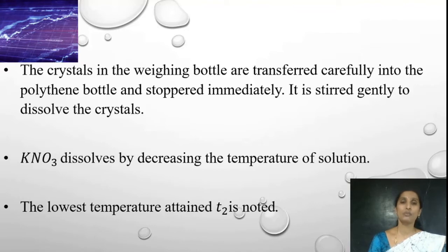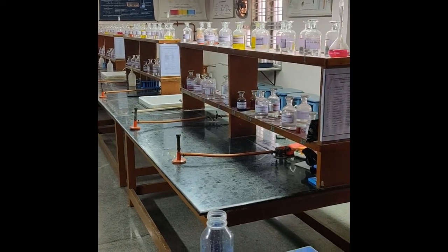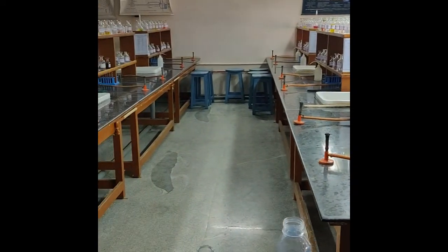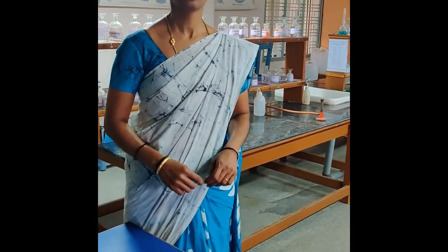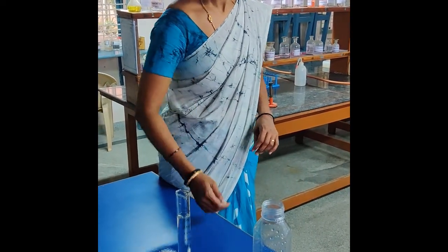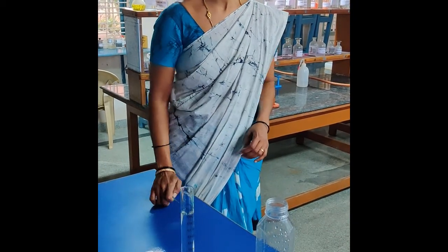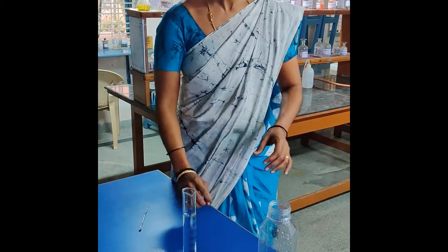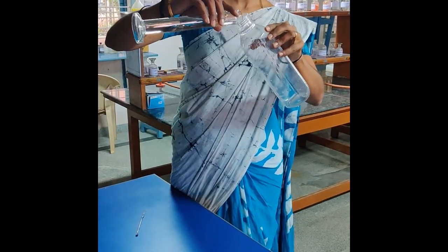Now let us do the practical part and record the values. As already explained in the procedure, I have taken a polythene bottle with a rubber cork fitted with a thermometer, a measuring cylinder with 100 ml of water, and 5 grams of potassium nitrate. First, using a clean measuring cylinder, I will be adding 100 ml of water to the polythene bottle.